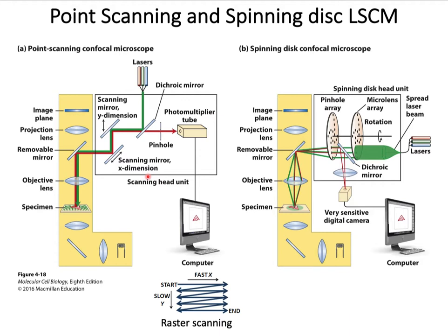Now, let's first understand what the microscope is going to capture as an image. The sample that you are going to image will be a 2D image. Think of it this way: a photograph of an individual is a 2D representation of an individual who has the third dimension, or thickness, as well, but that is not there in a photograph. In the same way, here we are considering a two-dimensional image of your specimen. So there are always two axes, X and Y, for any two-dimensional object. As we are not considering its thickness or third dimension, the Z-axis is omitted.